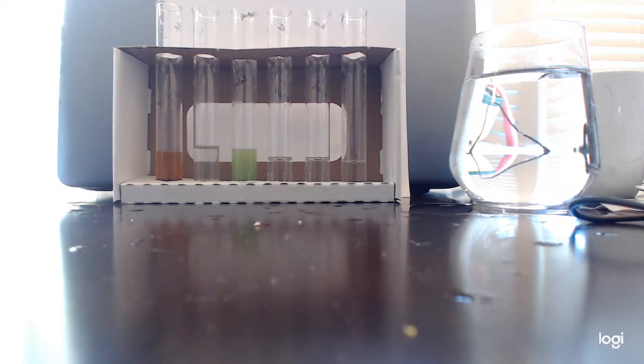Like I said, I'm not going to do the salmon because I bought the salmon. It was $9 a pound. I'm going to eat the salmon. Just put that it's positive for protein and for fat. Okay, there's no starch in it.